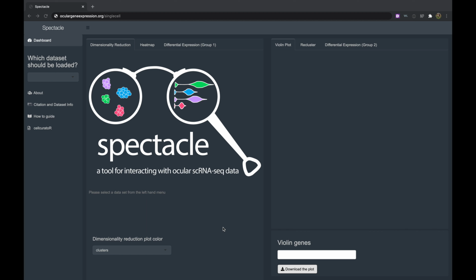Hello everyone. In this video tutorial, I am going to show you how to use all the functionalities within Spectacle, which is an interactive resource for exploring single-cell gene expression studies in the eye. To access Spectacle, simply open any web browser and navigate to oculargeneexpression.org/single-cell. This is the landing page for Spectacle.